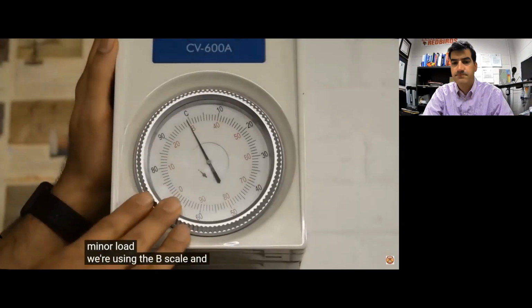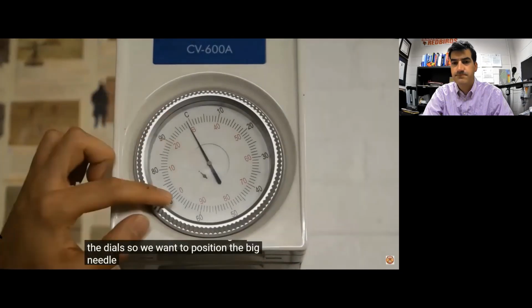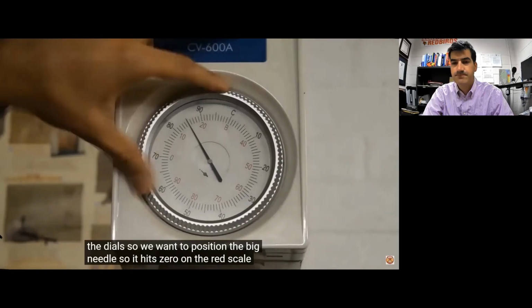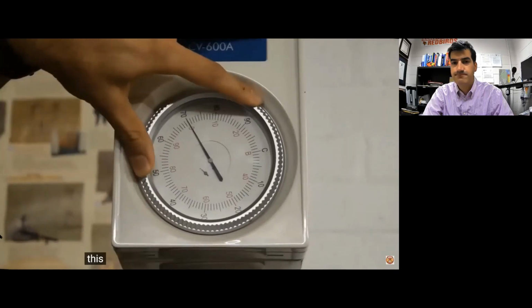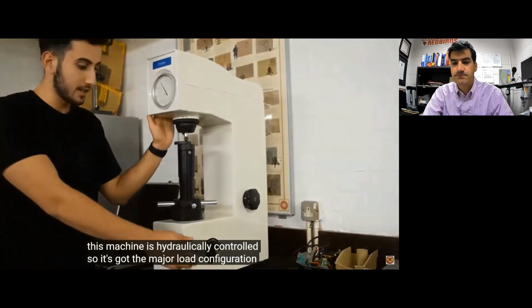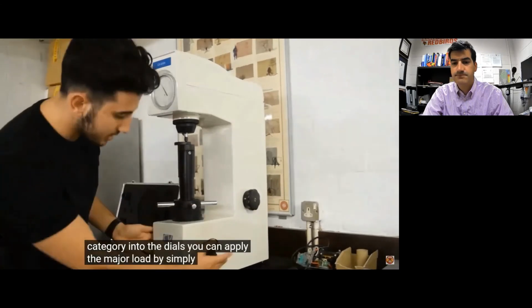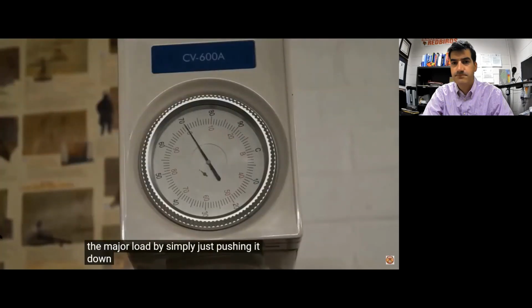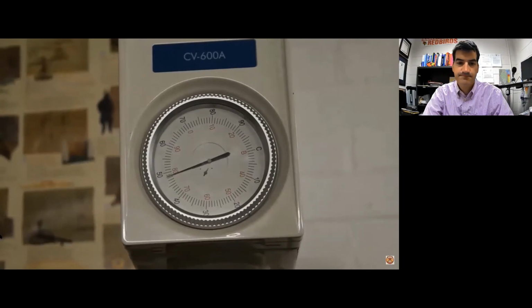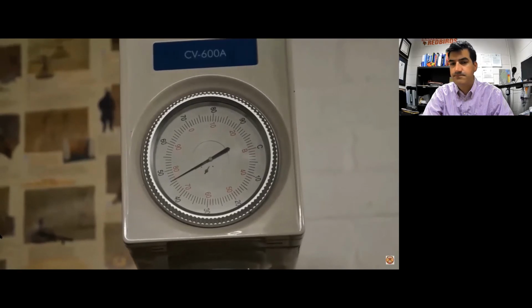If we're using the B scale indenter, we have to look at the inside reading of the dials. So we want to position the big needle so it hits 0 on the red scale. This machine is hydraulically controlled, so it's got the major load configuration setting here. Once you've applied and calibrated the dials, you can apply the major load by simply pushing it down. Then you wait for the needle to settle, and release the load.